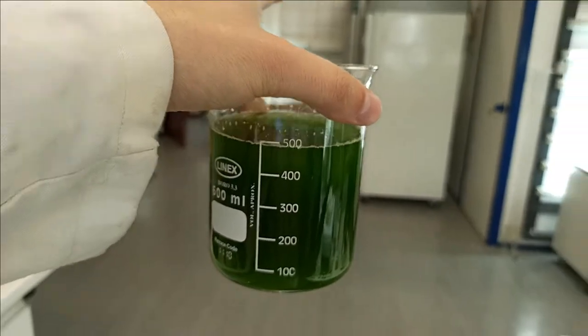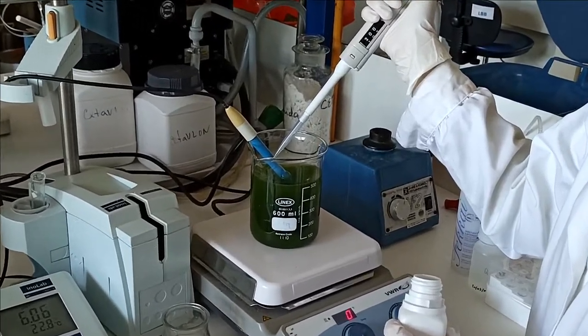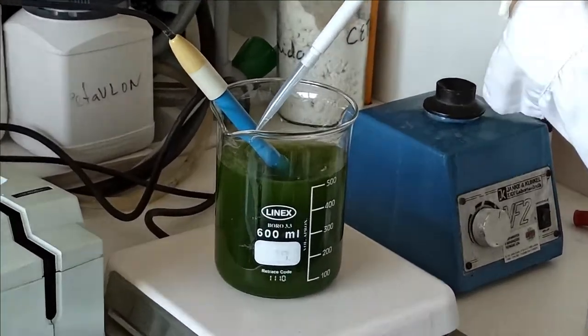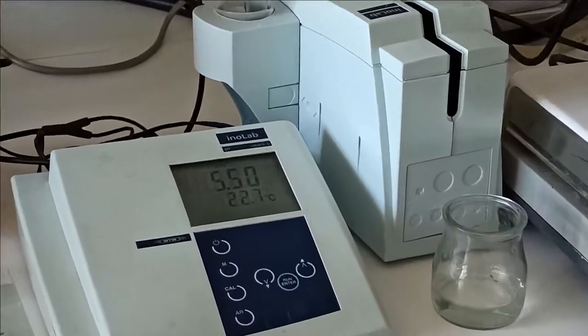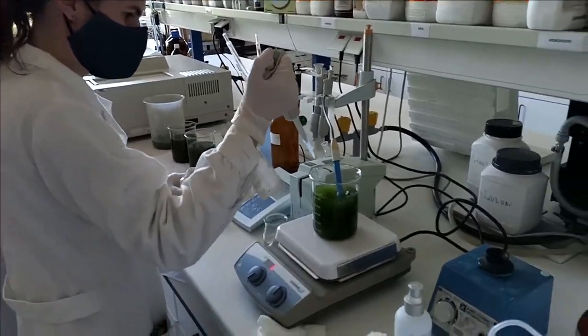So now pick your culture and adjust pH. We have seen that chitosan is more efficient at acidic pH so we set it to 5.5, but be sure to optimize it before.